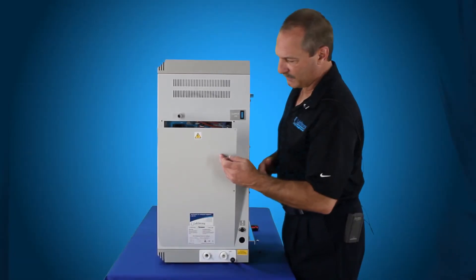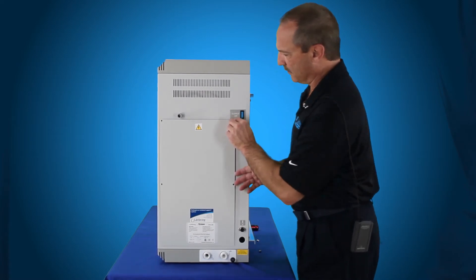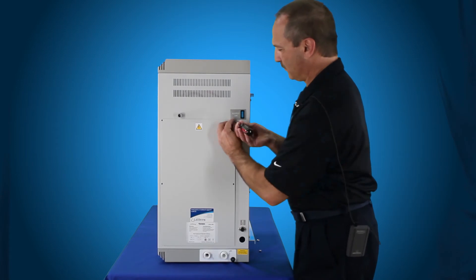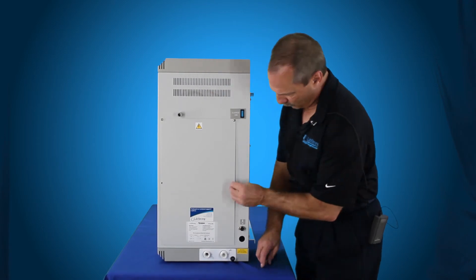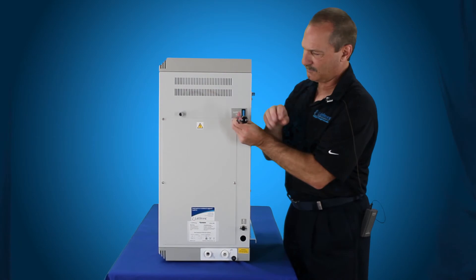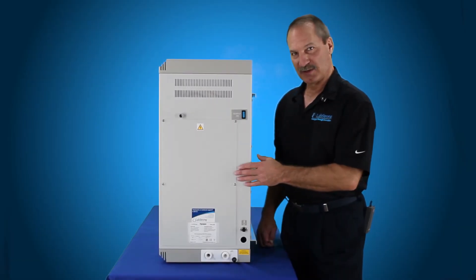With everything back in place, we're putting our right side panel back on with the four screws, locating the four holes to put the screws back through. Then you're ready to operate the unit because you've got your solenoid valve set back in place. At LabStrong, we are committed to making your lab life easier. For additional assistance, please contact the experts at LabStrong.